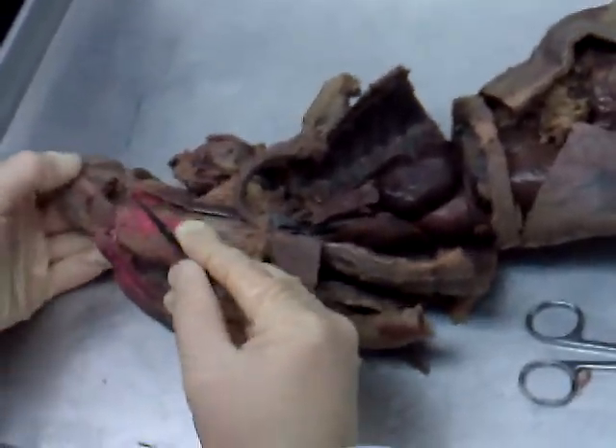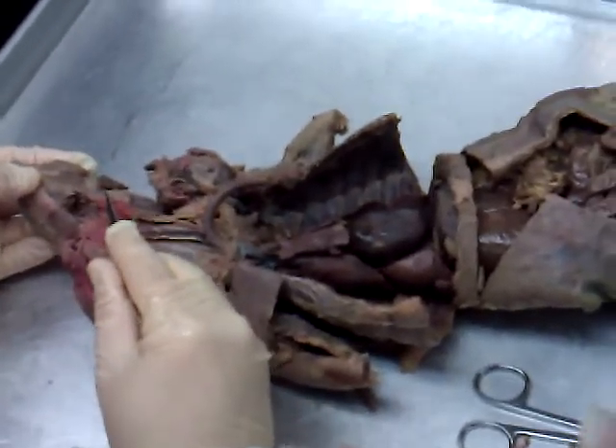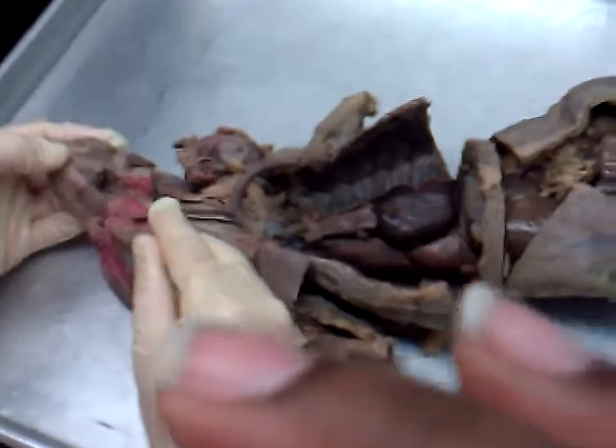Pull that back out of the way. The hole that's remaining in here is the pharynx. Then right in here, this is one of the salivary glands — the submandibular gland.